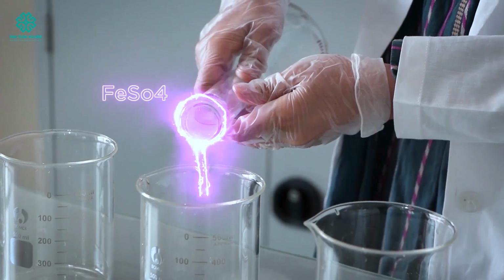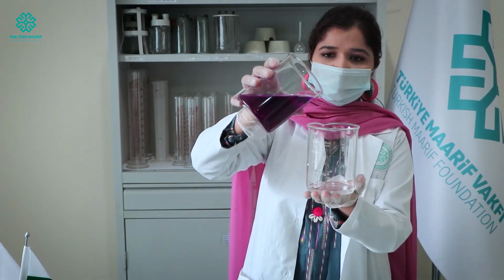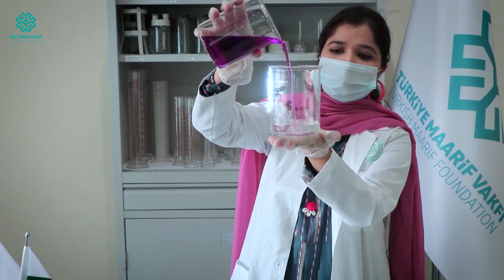Now I am going to transfer the solution of beaker 4 to beaker 5. In beaker 5, we have 20 drops of freshly prepared ferrous sulfate solution, which is acidified. I am transferring the solution of beaker 4 to beaker 5. Again, the color disappears.